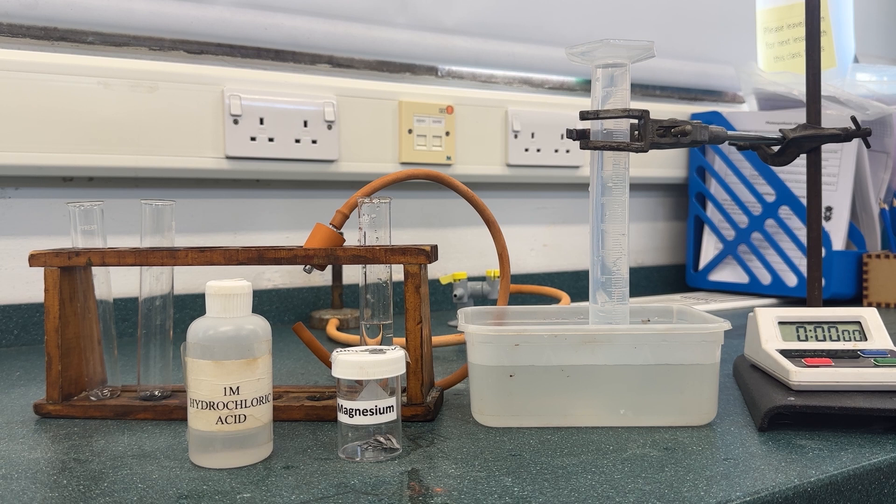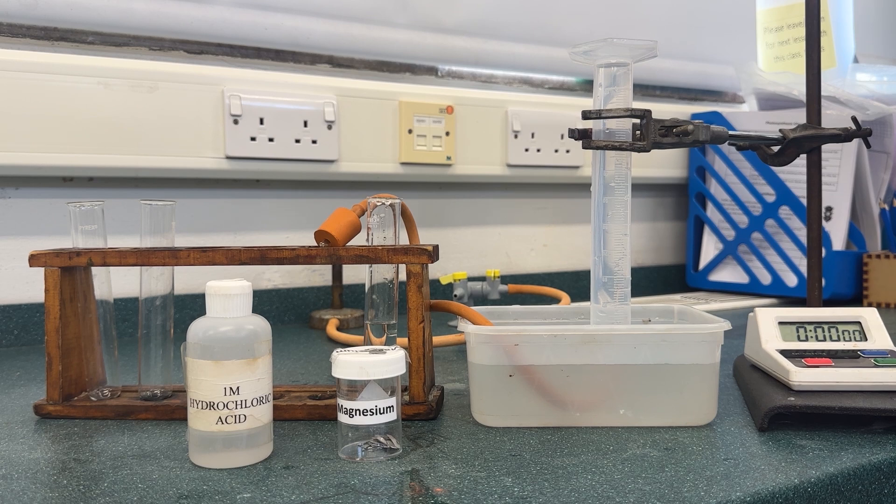In the picture you can see the setup for following a reaction where you're going to bubble the gas through water and collect in a measuring cylinder. You need to have a boiling tube or a conical flask in which you'll have your reaction. You then have a delivery tube which will place into an upturned measuring cylinder full of water. This is held in a tub of water. You also need to have a timer nearby.